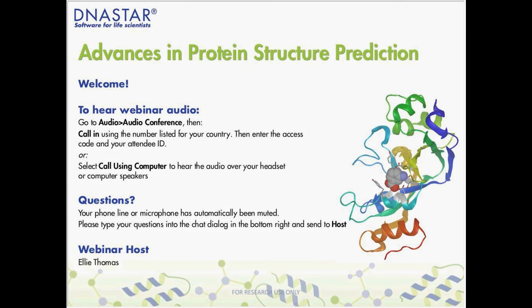I am here with my colleague Katie Maxfield, and today Katie will give a live demonstration of protein structure prediction in NovaFold. You may have noticed that your microphone has been muted.